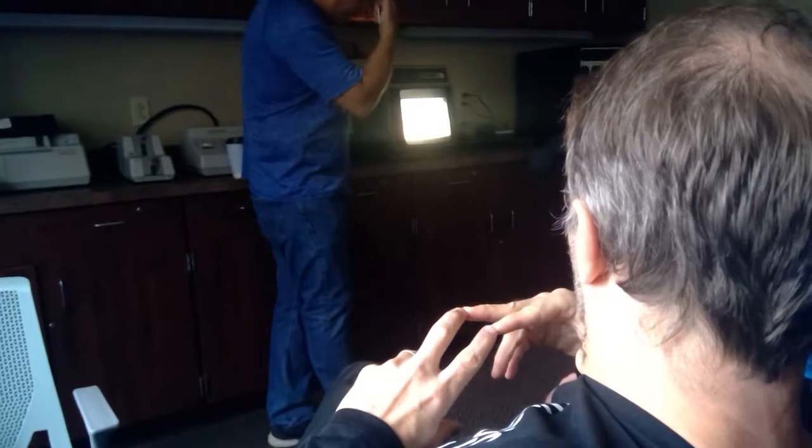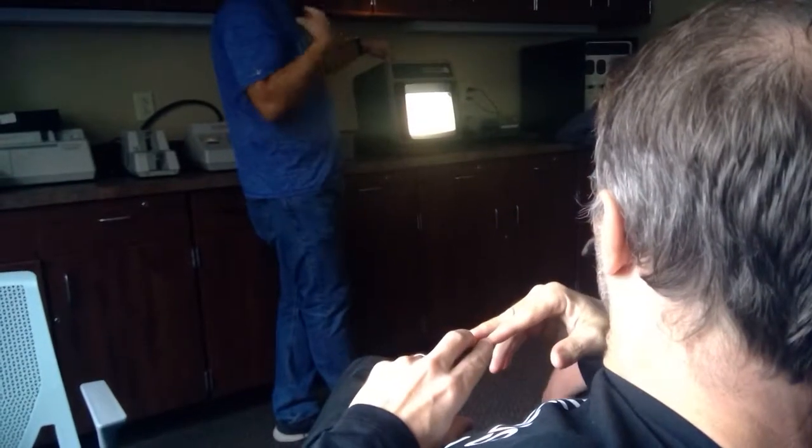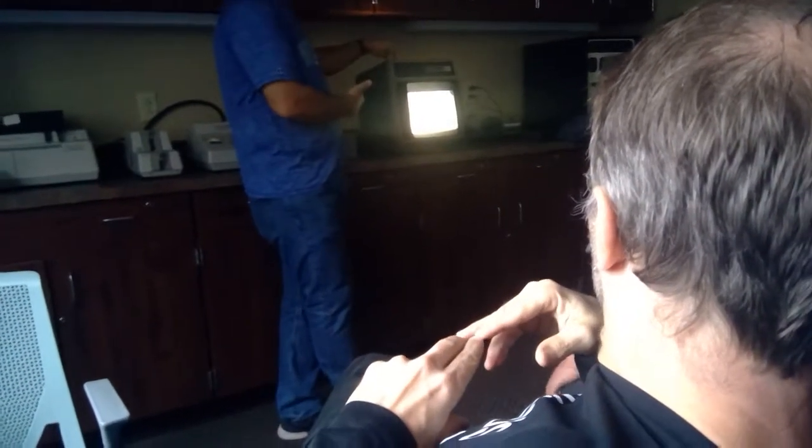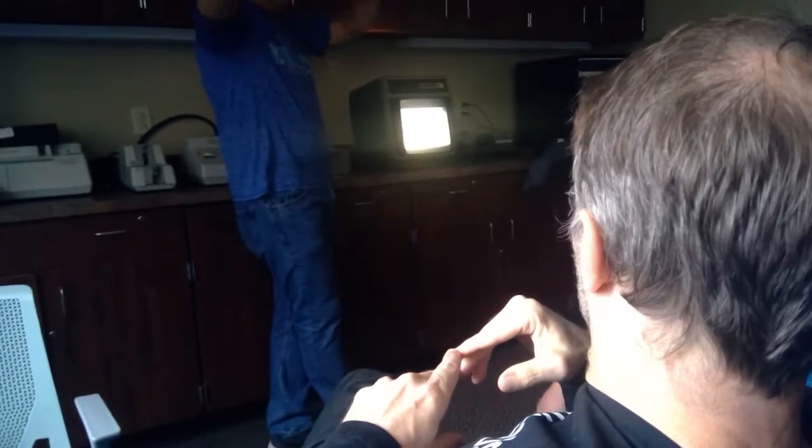Yeast. Yes, yeast. There's also some white blood cells in there, but remember, on yeast, it's going to bud. There's going to be budding. You will see budding yeast a lot more than you will branching hyphae, okay? Branching hyphae is like a severe yeast infection to where you'll see the little, I call them tree branches.